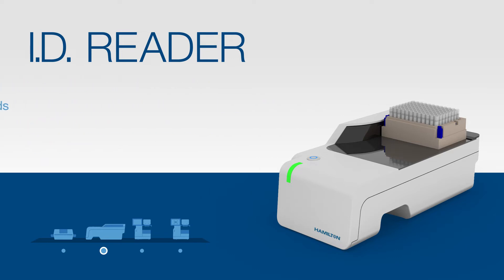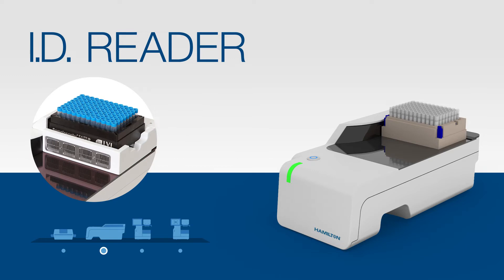If you're working with frozen samples, our ColdScan accessory can be added to the ID Reader. ColdScan blows air across the bottom of the rack, eliminating condensation that might otherwise interfere with barcode scanning, all without thawing samples.